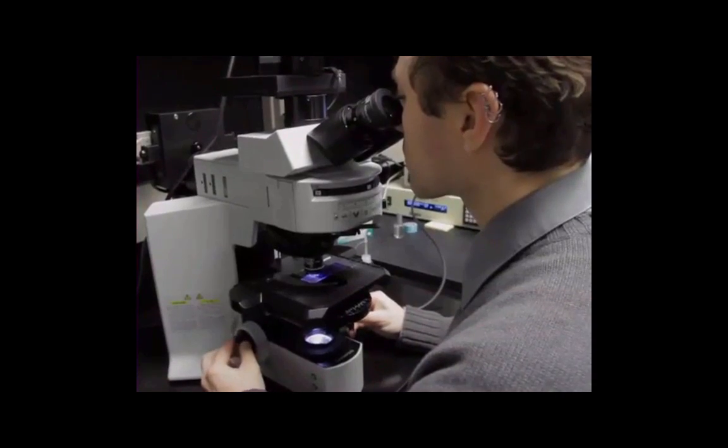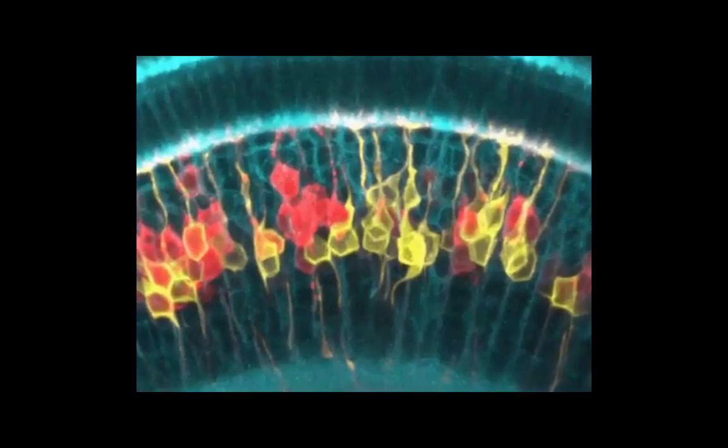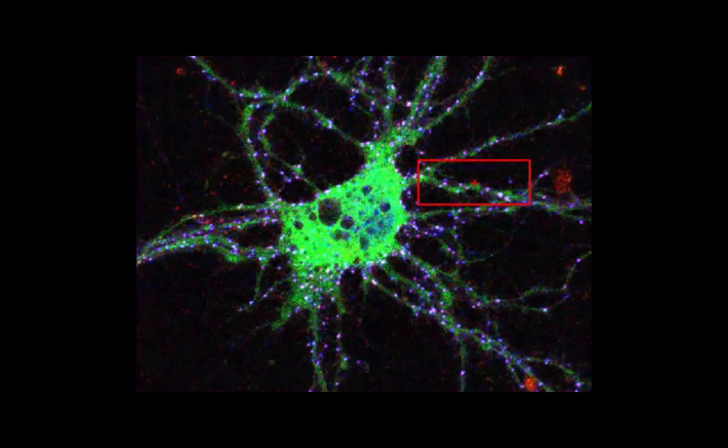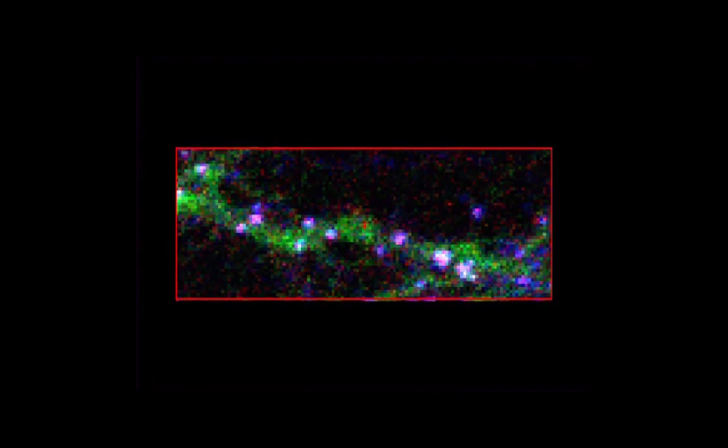The fluorescence light microscope allows for immunolabeled proteins to be imaged in tissue sections, or in culture, and permits co-localization studies, which involve determining whether or not two proteins are in close proximity within a single neuron.